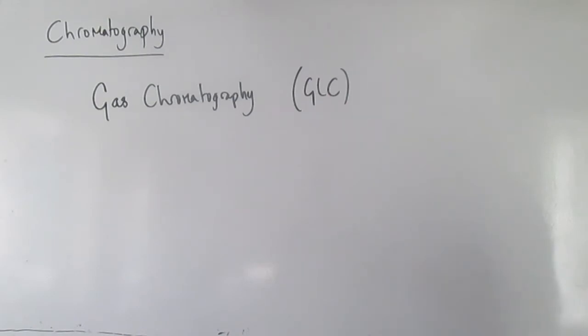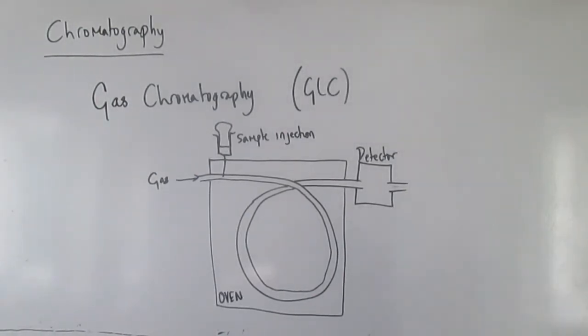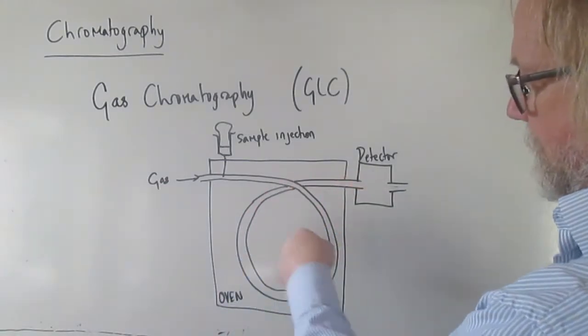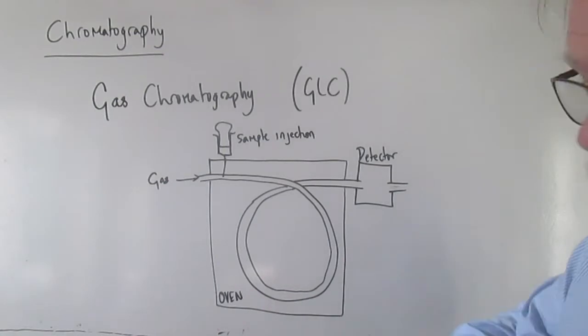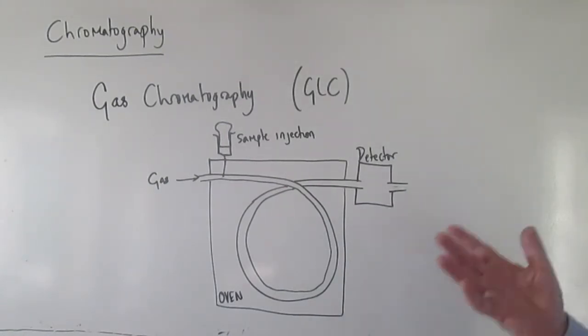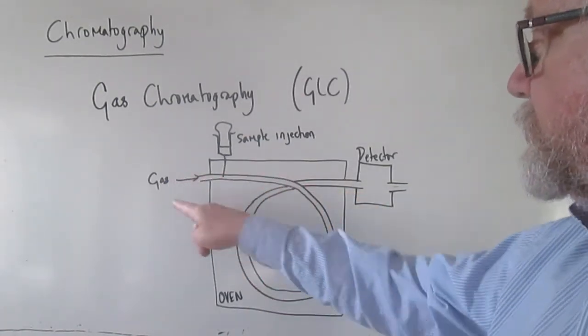So let's have a look then at how a gas chromatograph works. This is a very simple, crude picture of a gas chromatography setup. What you have is this long tube, and it's typically coiled up like this, and in fact coiled many times, simply because it's a very long tube. It can be tens of meters long, and obviously it's inconvenient in the lab to have it all stretched out, so you coil it up so that you can fit it inside this box. And the box is an oven, for reasons we'll talk about in a minute. So you typically see it drawn as a coiled tube because that's physically what it's like. But the coiling is there simply because it has to be small enough to fit in the lab.